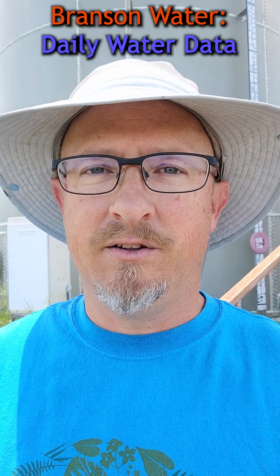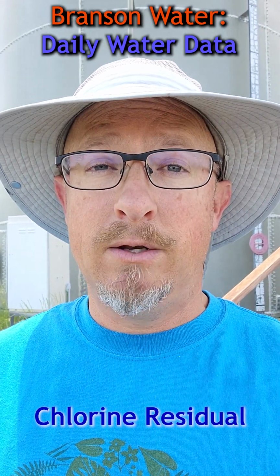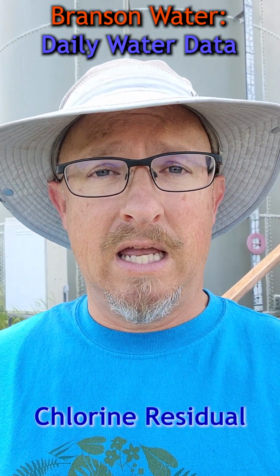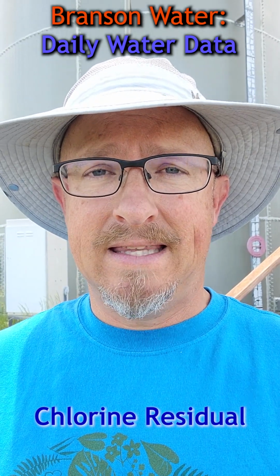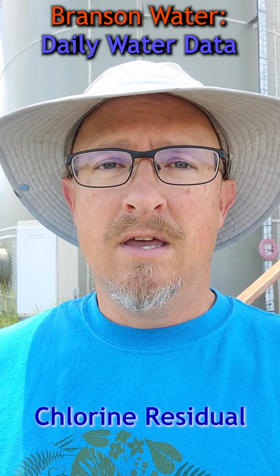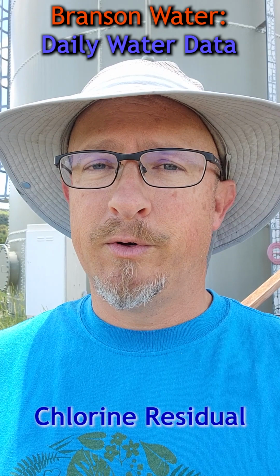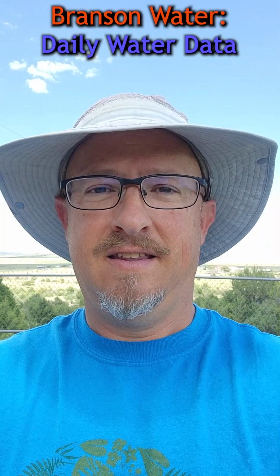A couple of final very important things you're going to want to record every day is the chlorine residual that you gathered either at the entry point or somewhere in the town distribution system, at your house, or maybe it could have been anywhere else. Make sure you record that chlorine residual on the data sheet or on the Google form, and we have videos about how to explain that.